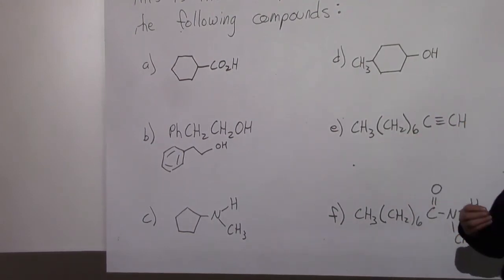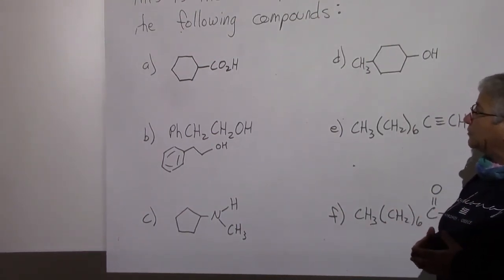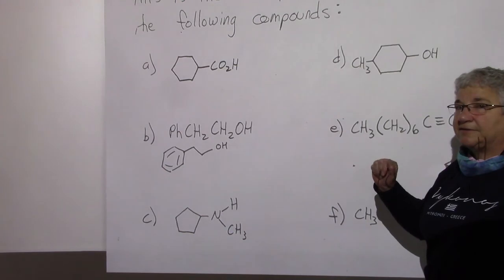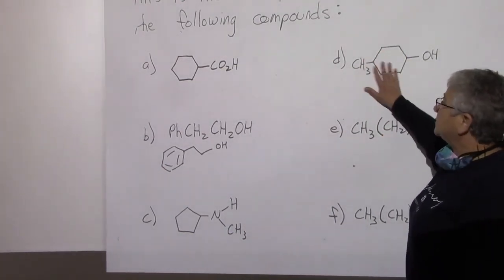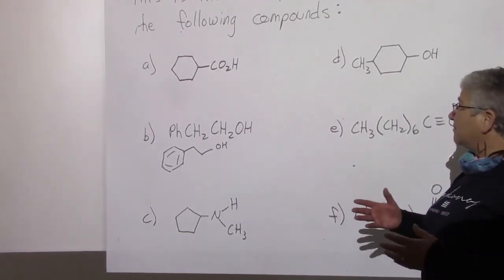And so here's where it gets technical. What's the difference really in an IR spectrum between this structure and this structure? And the answer is that in this structure, everything is saturated, right? They're all carbon-hydrogen saturated bonds. There's no double bonds, there's no aromatic ring.